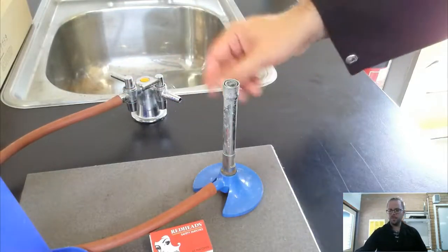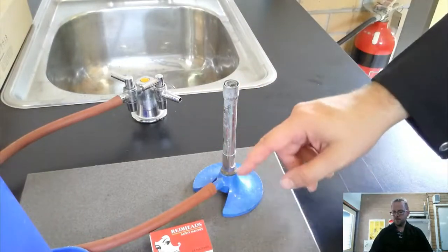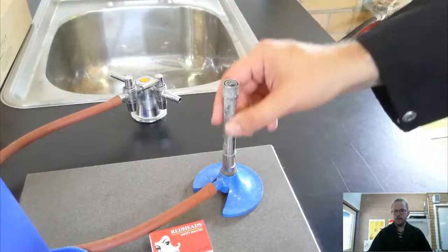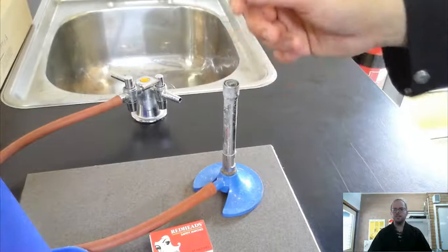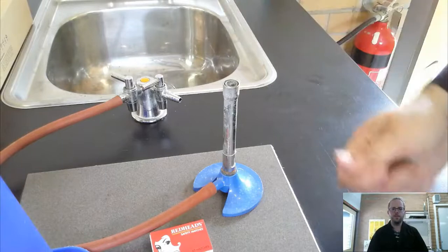That allows the gas to flow from the tap through there and then into the Bunsen burner. The gas goes up through this chimney, it's called, and then we light it so that the flame is here at the top. And that's where the heating flame comes from.